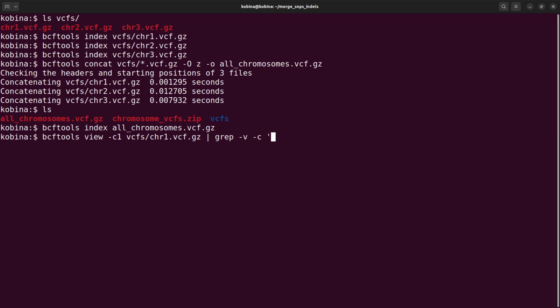I bring my single quotes, caret hash, single quotes. So let's count it. Perfect. We now have 208. So the number of true variants in the chromosome 1 file is 208. All right. Now we need to get the same number in the merged one.